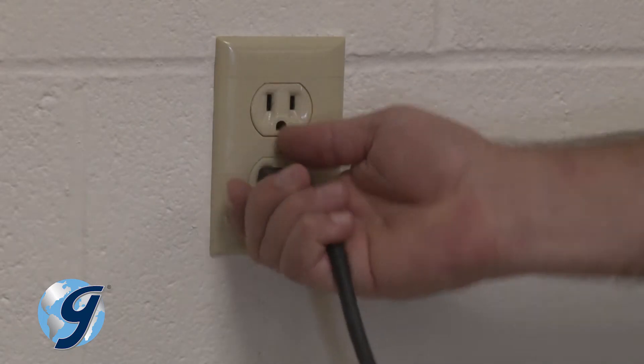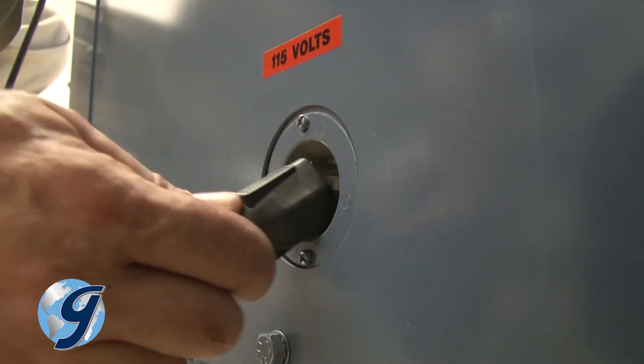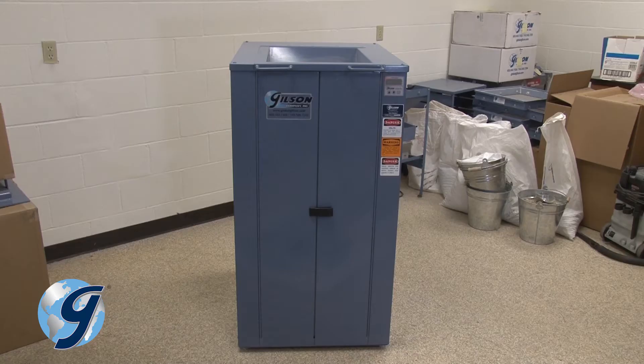First, unplug the unit from the power source. Then unplug the power cord from the unit. Move the Testmaster away from walls to allow sufficient room for working.